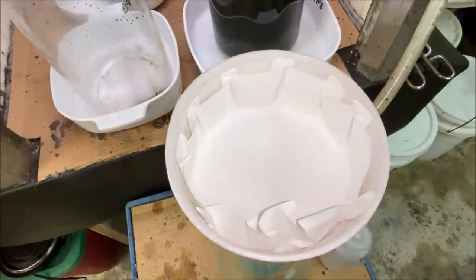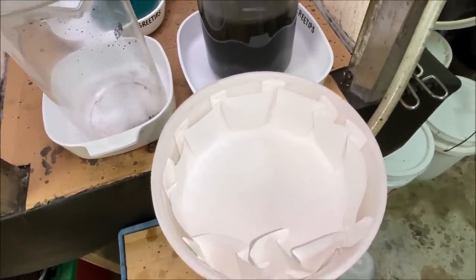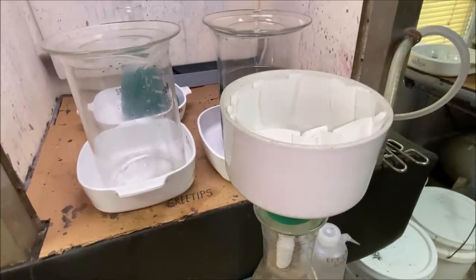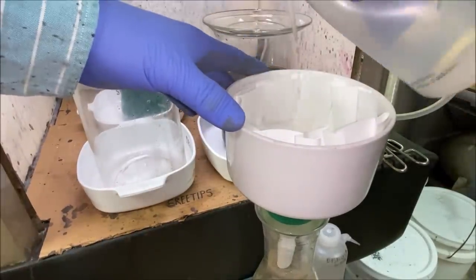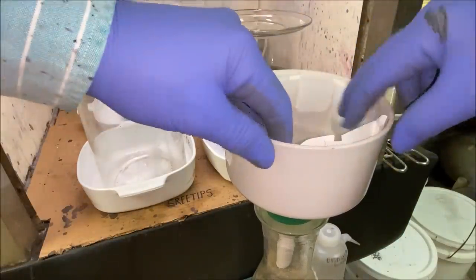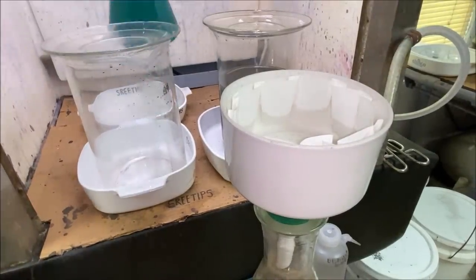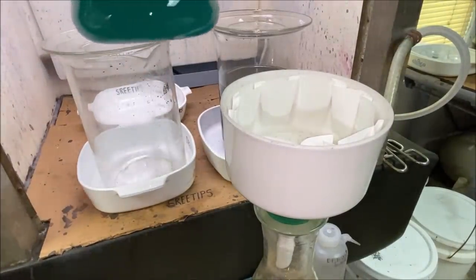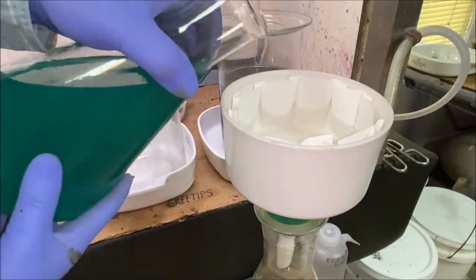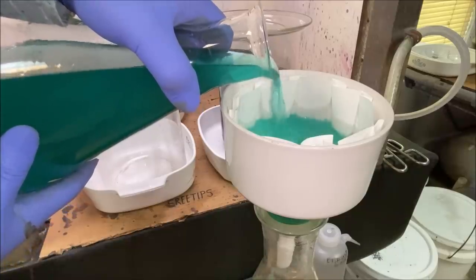Here I have one of my specially folded filter papers in a 12.5 centimeter Buchner funnel, and this is folded in such a manner that the filter rides up the sides of the funnel, and we can capture 100% of the solids without any of it coming into contact with the funnel.